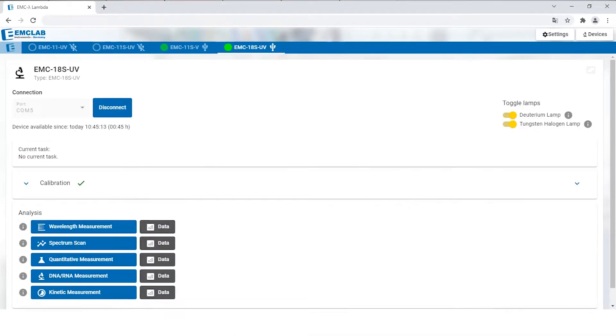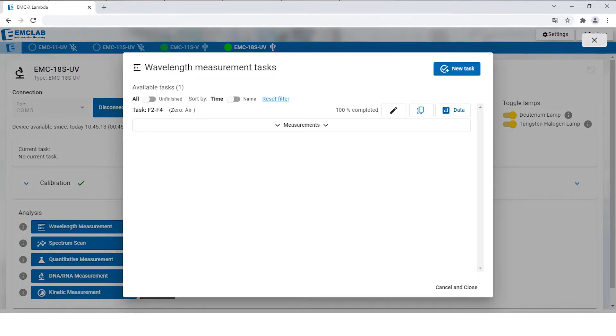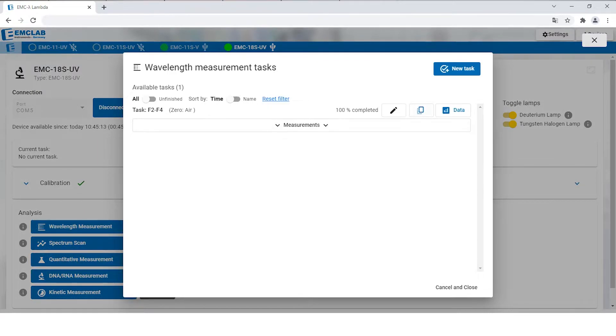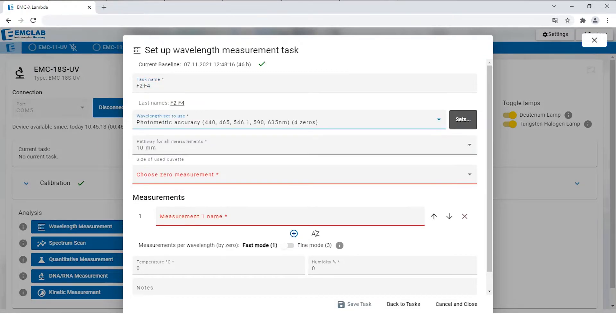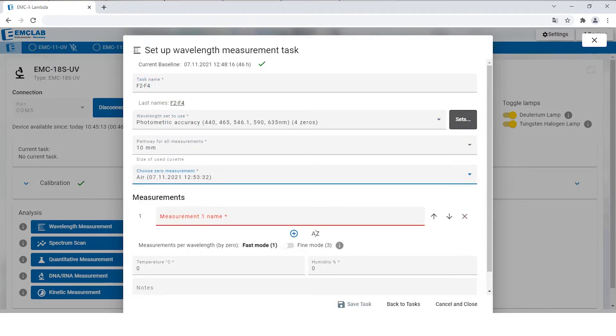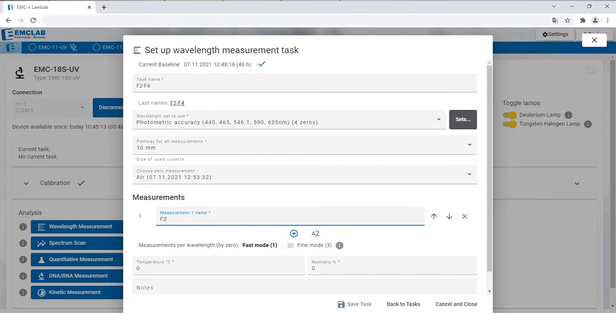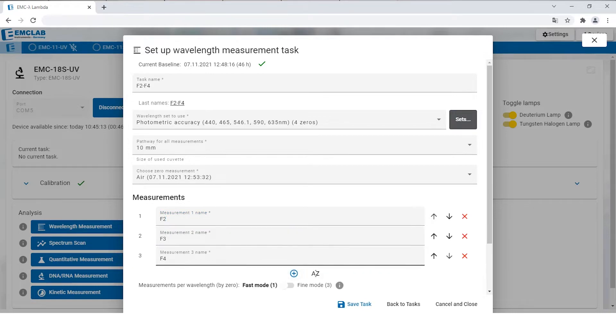When you've chosen an activity, you are able to generate a new task. In this case we will use the menu item wavelength measurement as an example to demonstrate how it works.